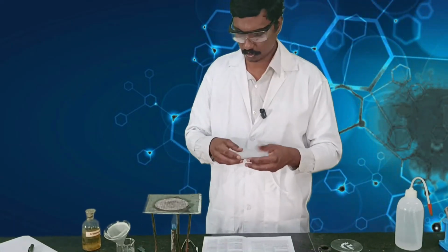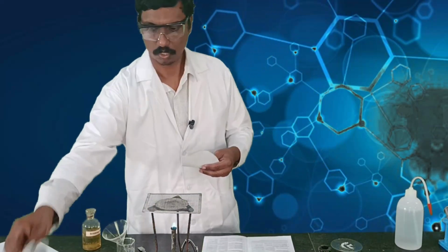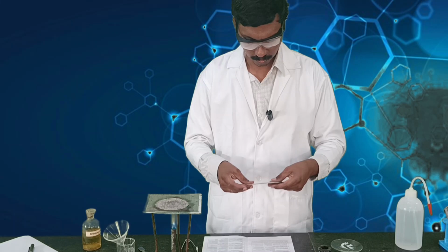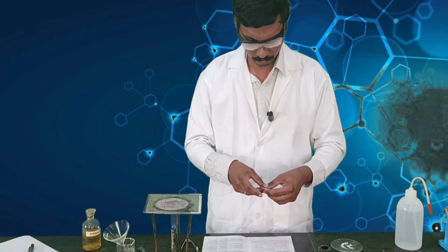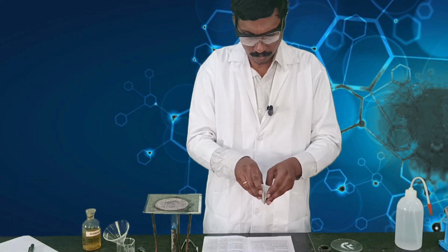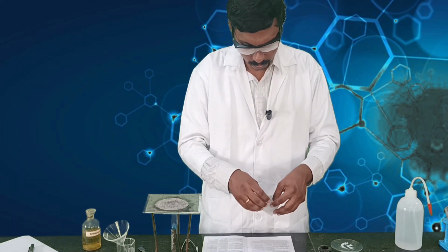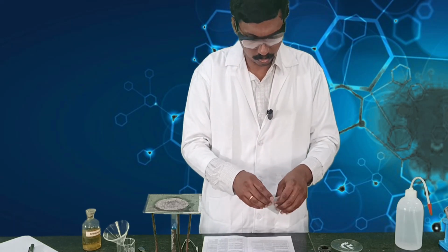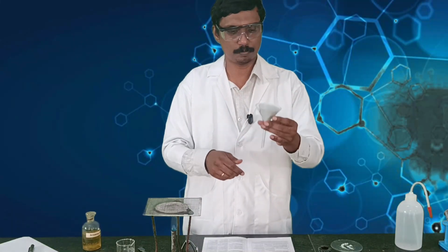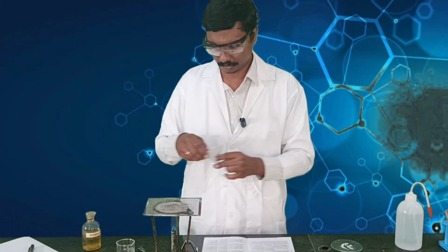The way you add this filter paper on top of the test tube is, you just take your filter paper, fold it into two halves, then again into another fold, and when you divide this in this manner, make sure that on one side there are three folds, and on the other side there is a single fold. Then you just keep it on top of the funnel, and this is how you prepare your funnel for filtering the extract.